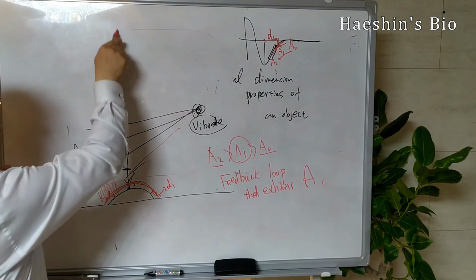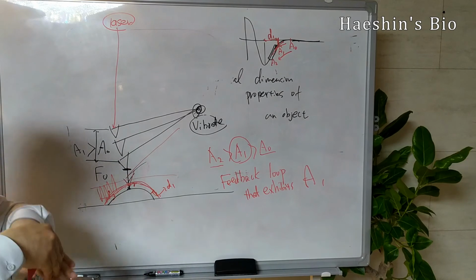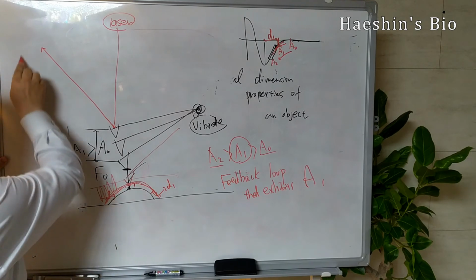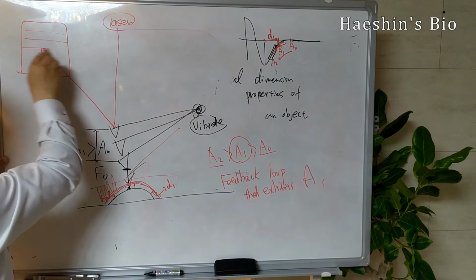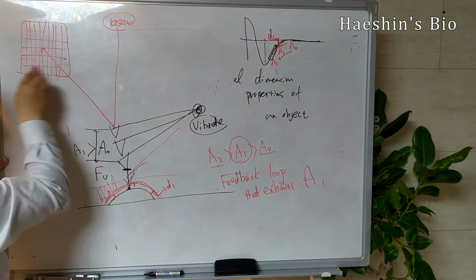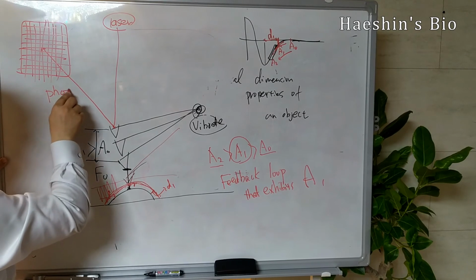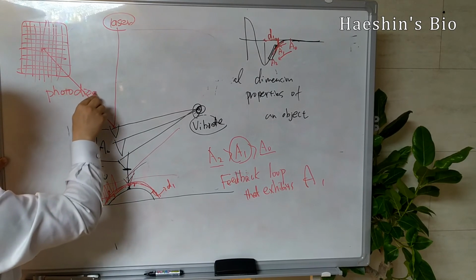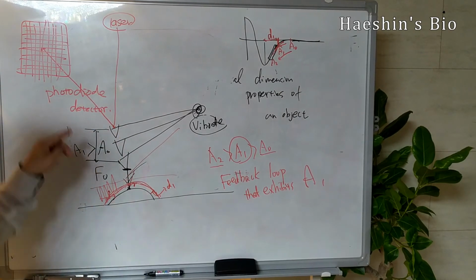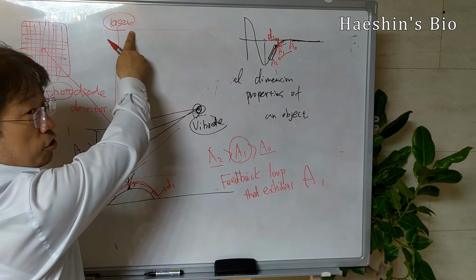They use a laser here. There's a laser provided here, so you can hit it on top of the cantilever, and the laser is deflected, and there's a detector. I should draw a little bit more line. This is called the detector, but this is a special one, a photodiode. Photodiode detector. This photodiode means photon, which is light. Light in this case is a laser.